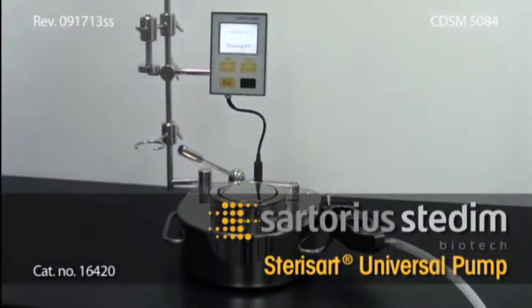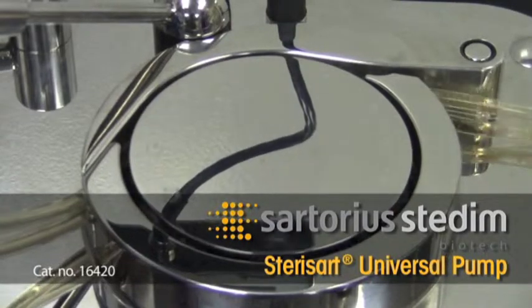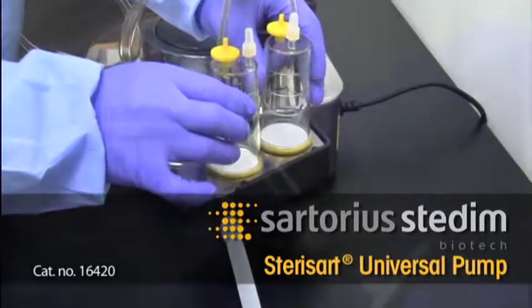The Sartorius Sterisart Universal Pump is a peristaltic pump equipped with the appropriate devices for attaching a closed sterility test system and a sample container.